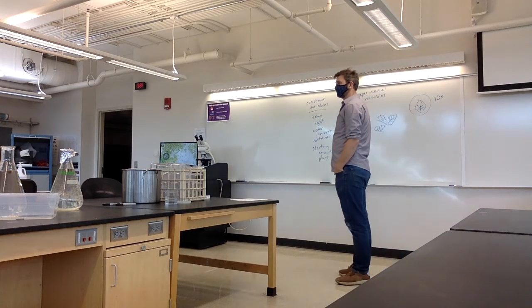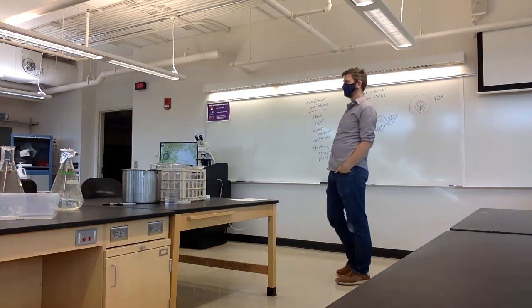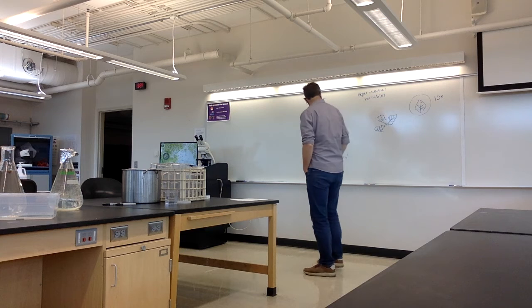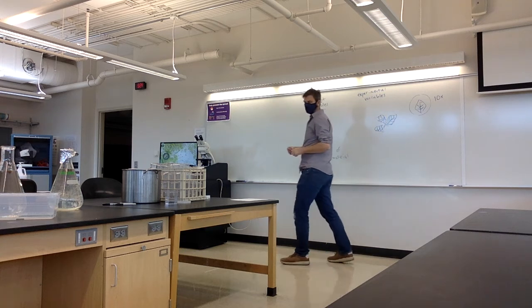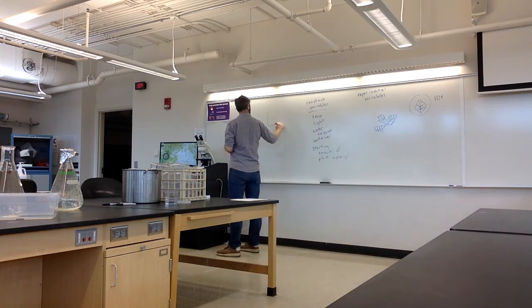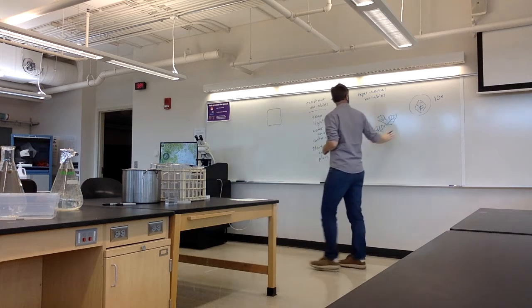Take measures of them something like a week later. Okay, what are we going to measure? What do we measure? Maybe. Actually, it might be possible. So we can kind of shoot for 10.